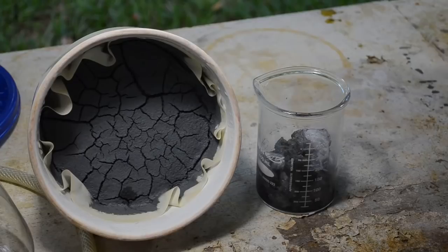That white precipitate seems to mostly be a problem during the first cementation. Subsequent cementations, you don't see much of it, because I guess it all comes out the first time. We'll see if it happens that way this time, or if things are going to change up just because I'm filming and give me agita here. We'll see. All right, let me move the camera and get set up.